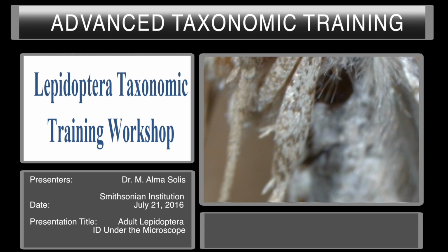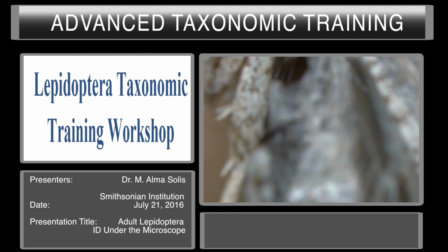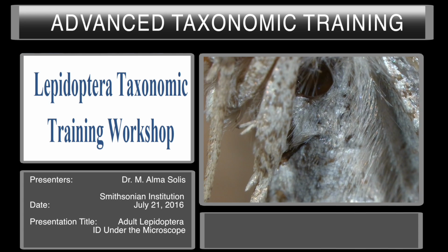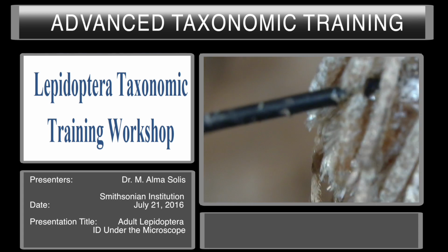So then we look at it laterally to see where the geometrid also has more of a lateral ventral type of tympanal organ. Of course, if it's very hairy, you may have to, with a brush, take off the scales or remove the abdomen. But here you can see the lateral tympanal organ. They're not completely ventral, they're lateral, and many times you'll see this hole or you'll see a hood in this area. So this is a geometroid.